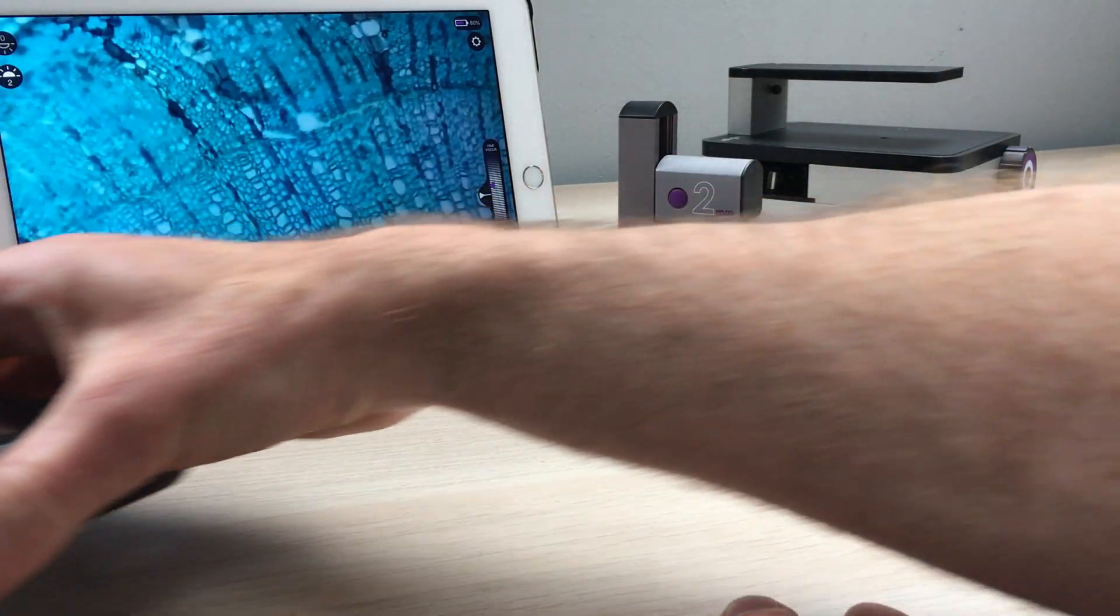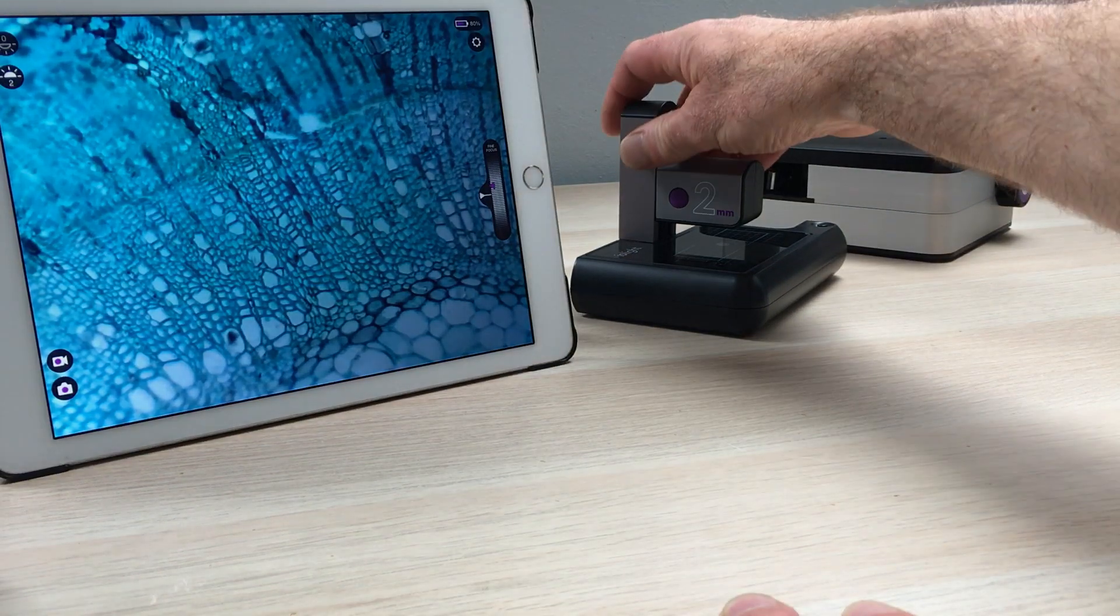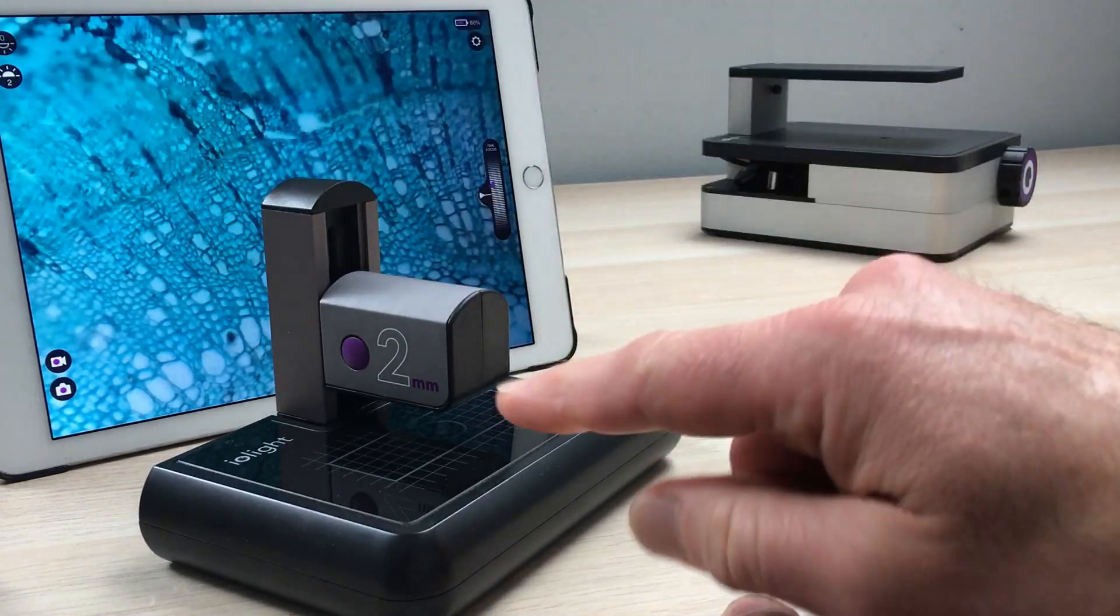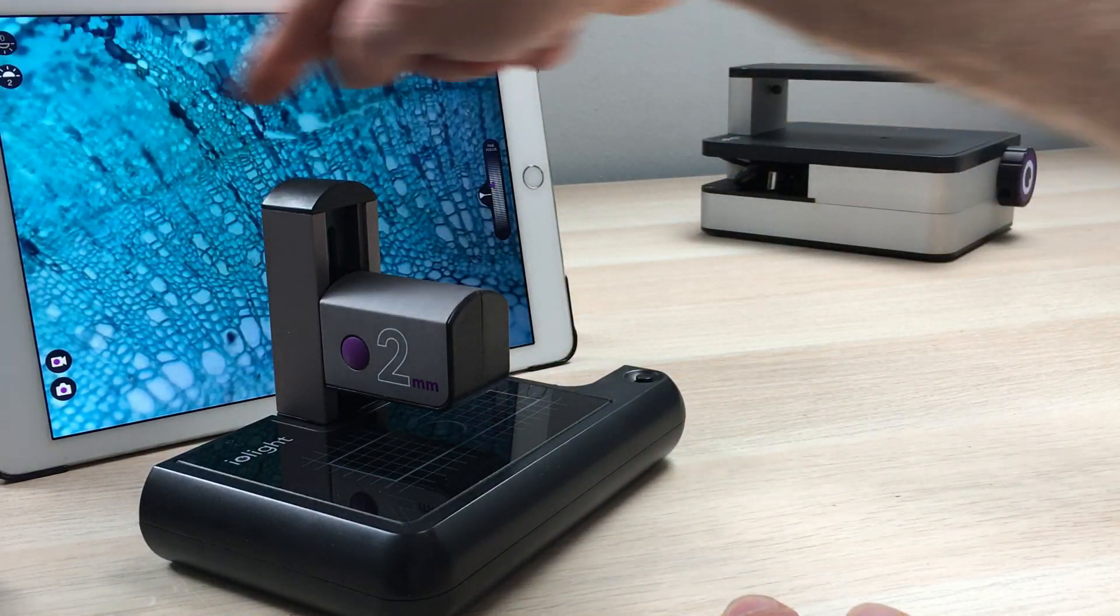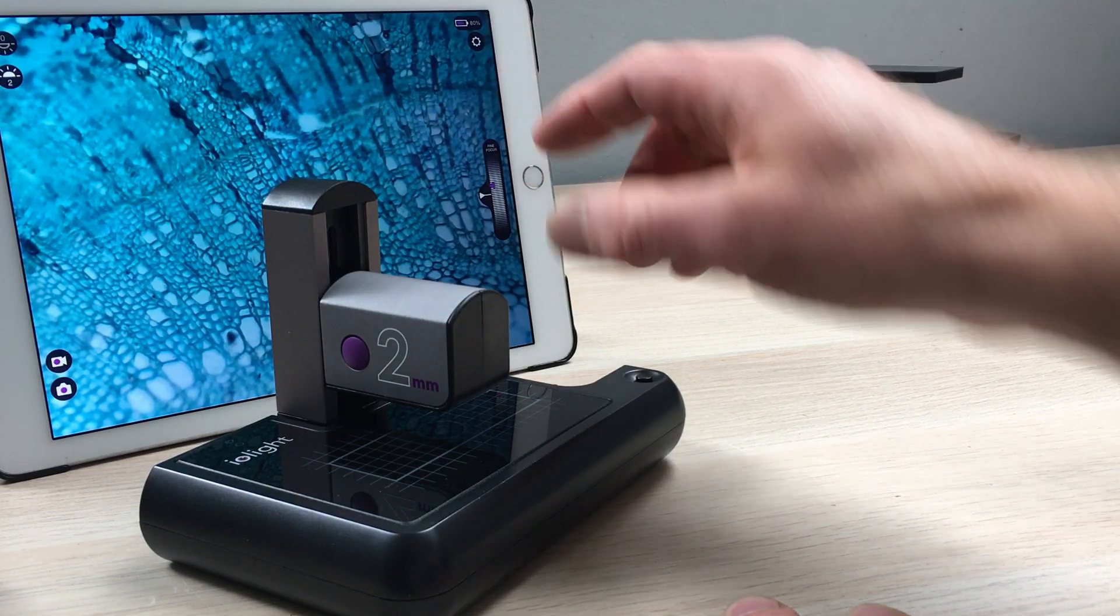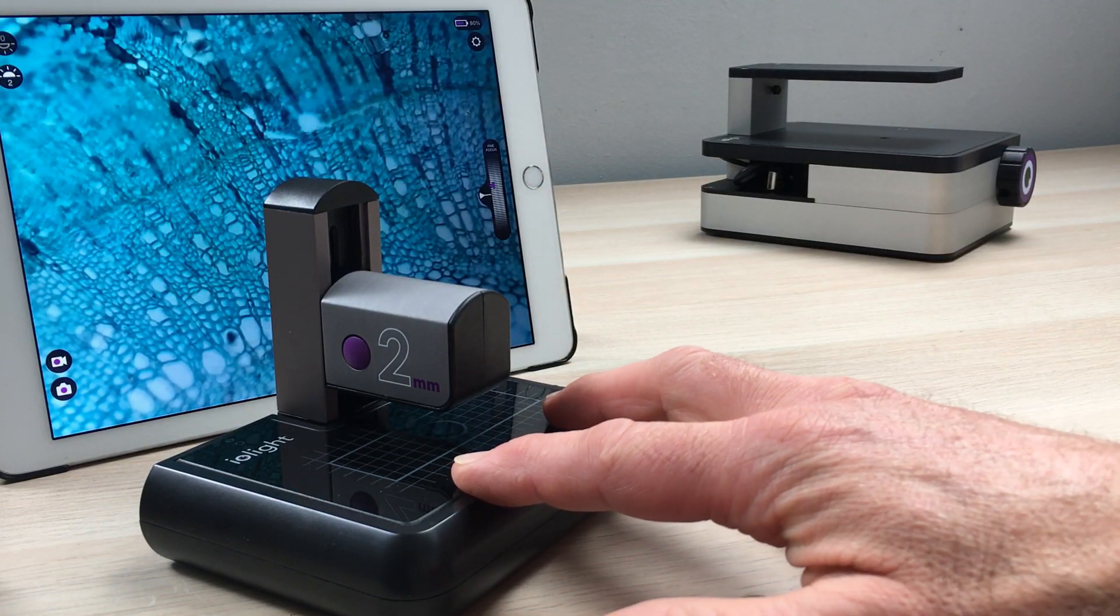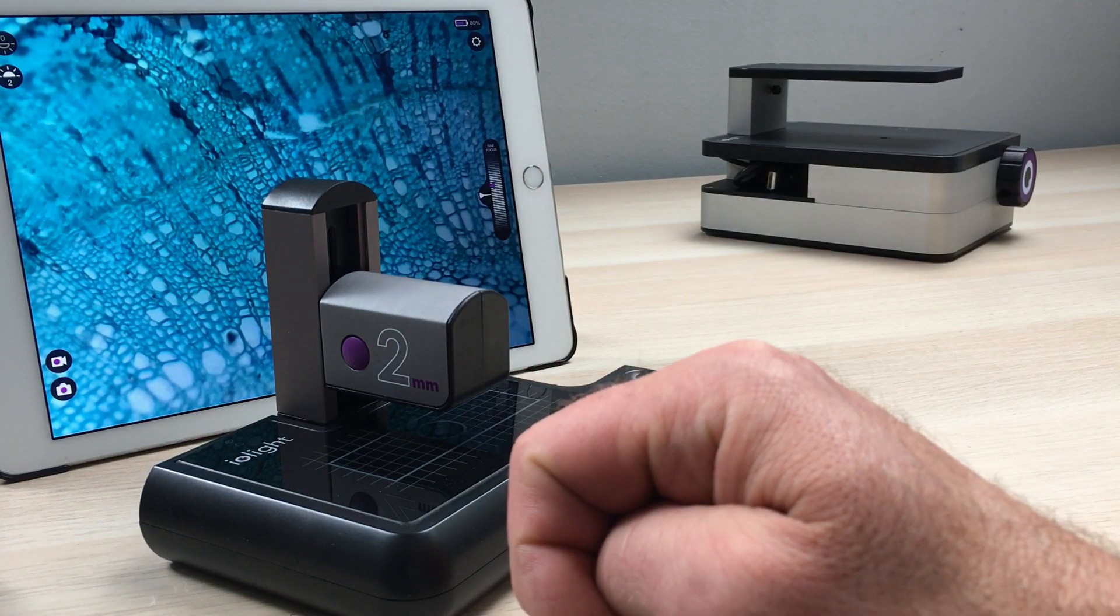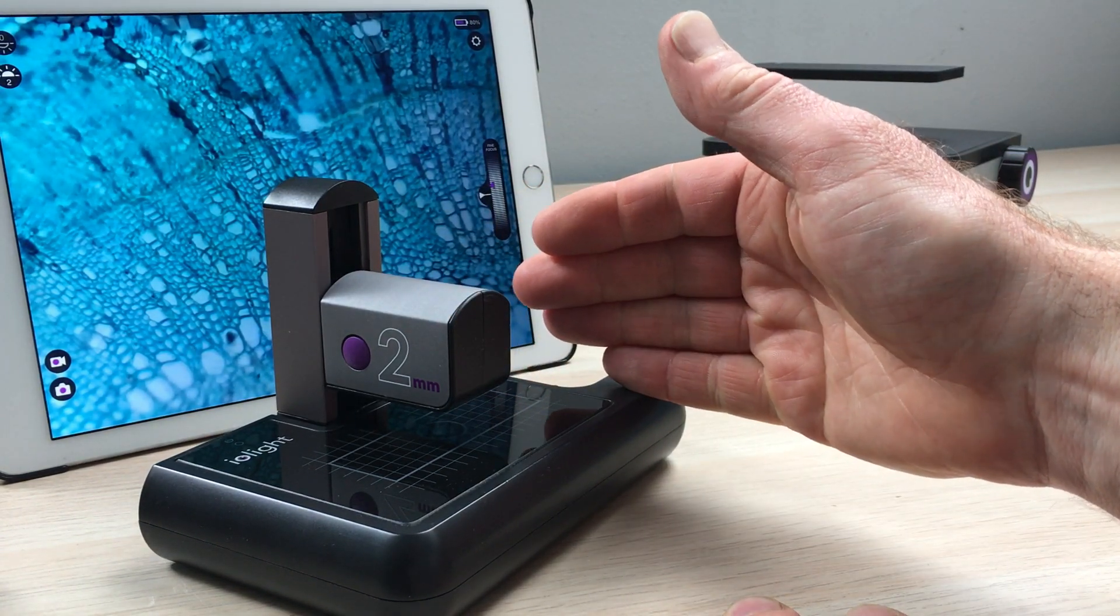We have a second version of this microscope that is almost identical except we call it the two millimeter microscope because the width of the image is two millimeters. This particular version is also better for samples that need to be illuminated from above, such as larger insects.